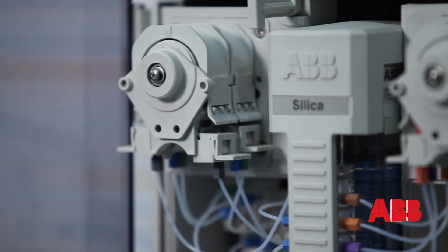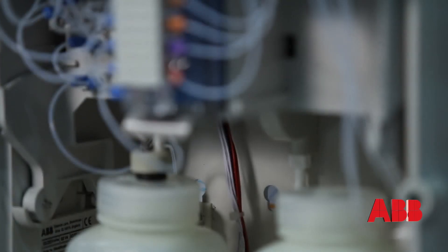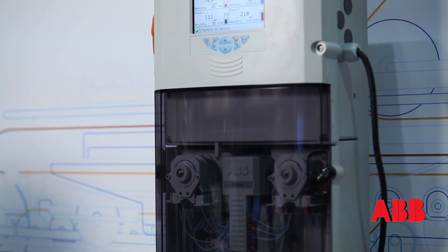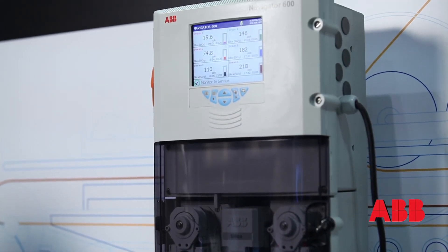One of the ways we make measurement easy for the Silica unit is that we provide fully programmable calibration and cleaning. The customer can set up the unit to clean and calibrate over a course of time, allowing a hands-free kind of maintenance procedure for the instrument.